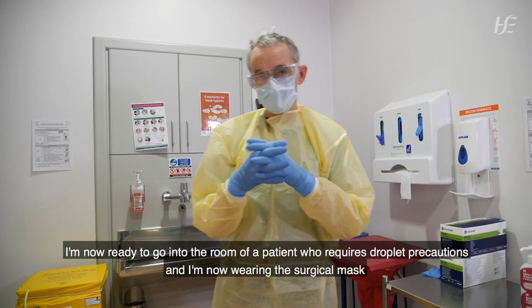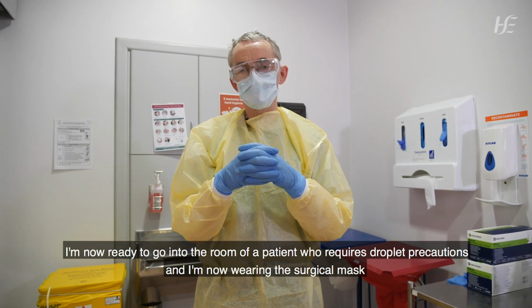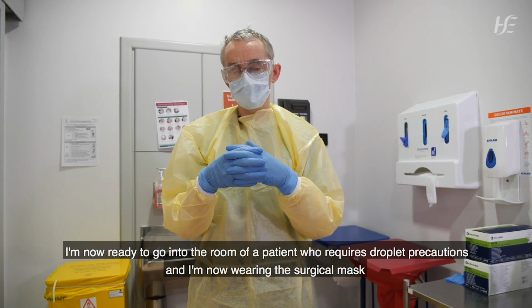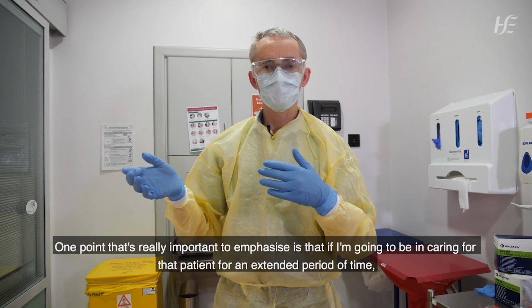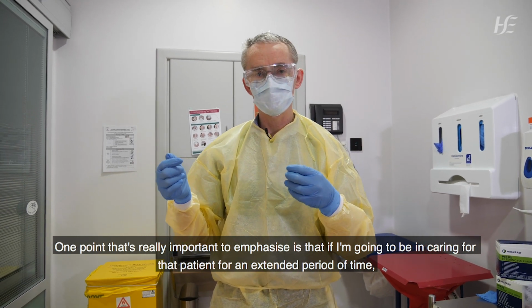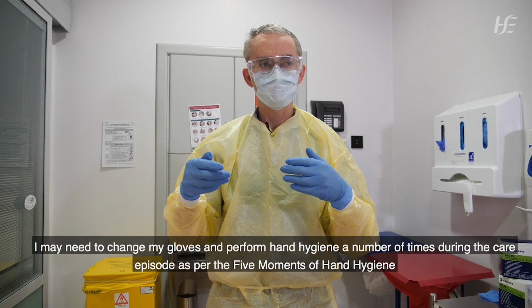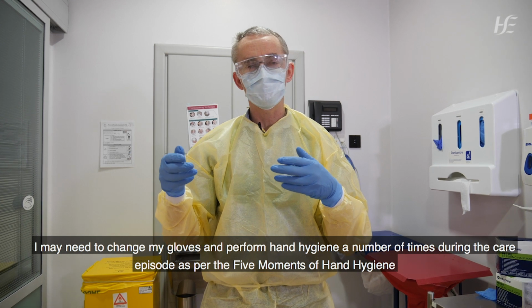So I'm now ready to go into the room of a patient who requires droplet precautions, now wearing the surgical mask. One point that's really important to emphasize is that if I'm going to be caring for that patient for an extended period of time, I may need to change my gloves and perform hand hygiene a number of times during the care episode as per the 5 moments of hand hygiene.